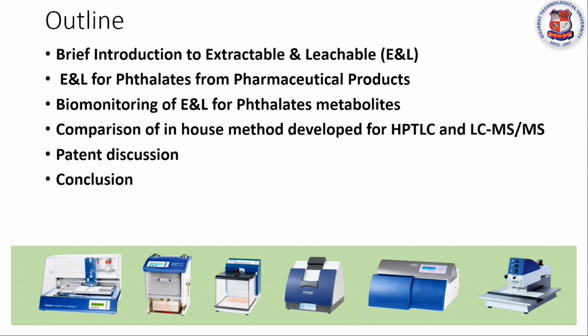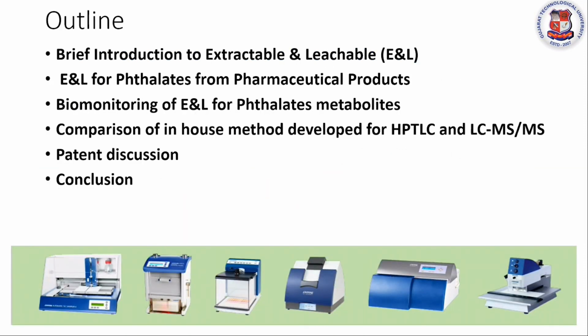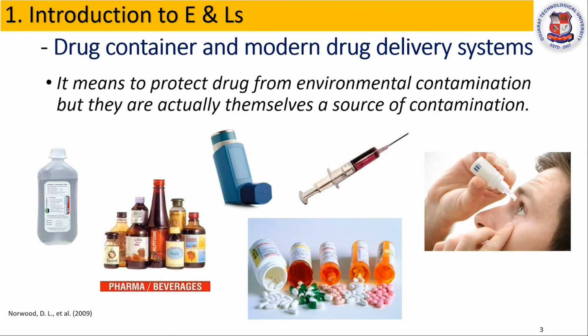Second part is biomonitoring of these leachables' metabolites, and third one is a comparison of in-house methods developed for HPTLC and LCMS. So let's start with the first part.